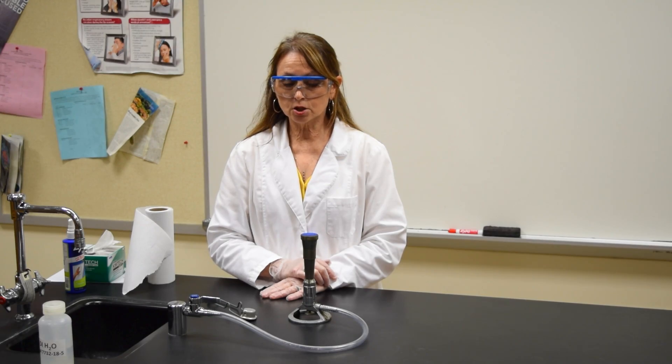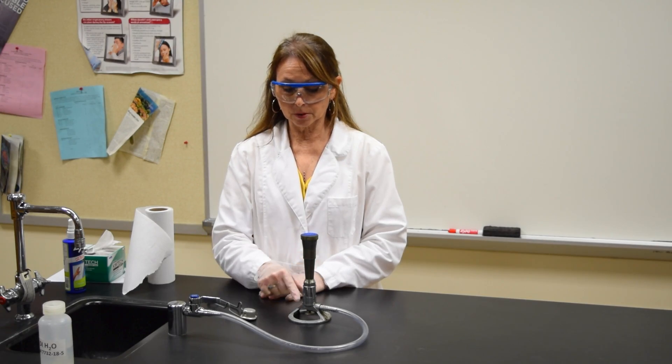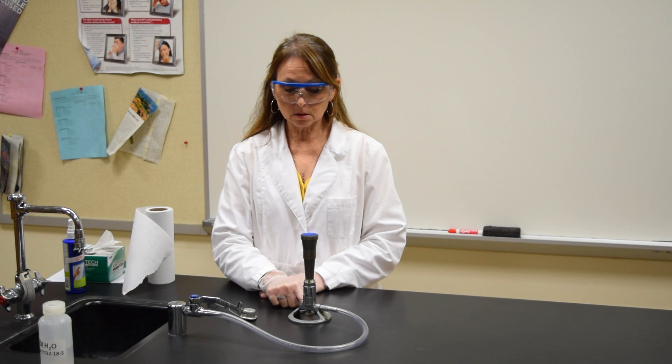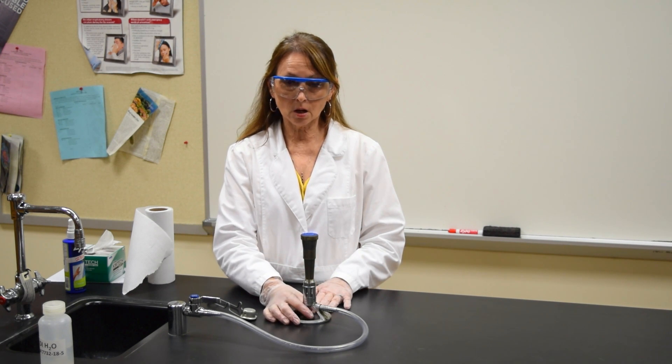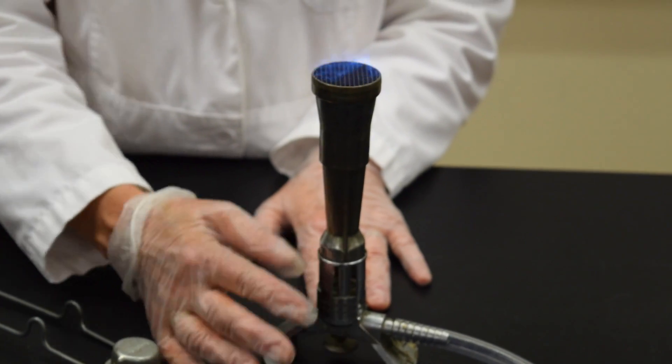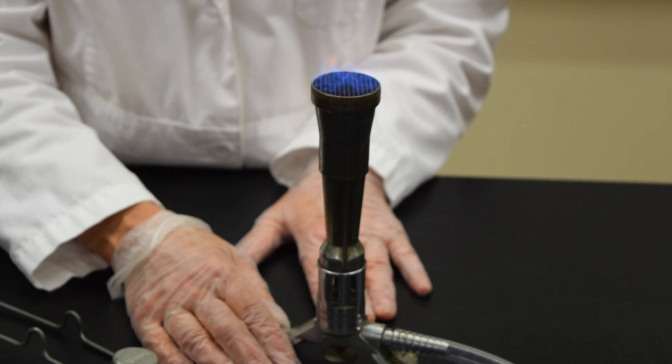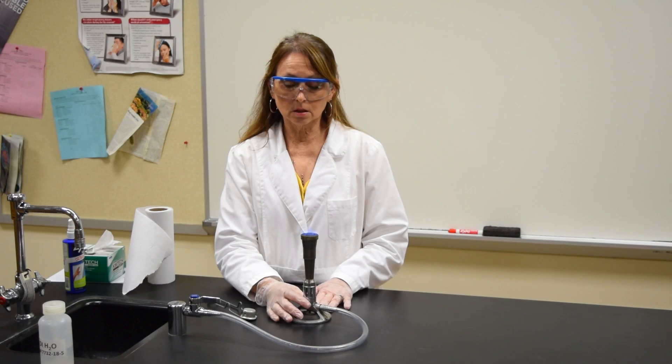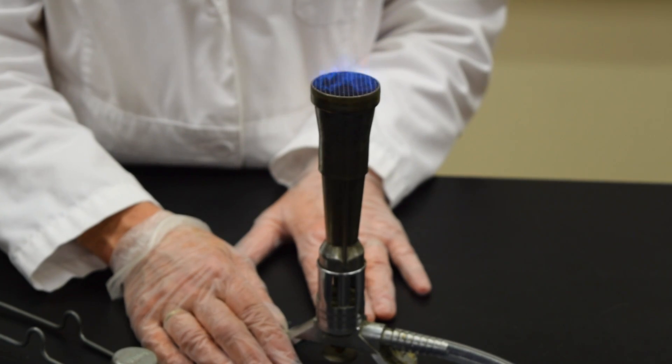To adjust the oxygen going through the flame of the Bunsen burner, there is a wheel at the base. If you turn the wheel clockwise, the oxygen going through the Bunsen burner is increased. The flame gets much higher. There's hissing.